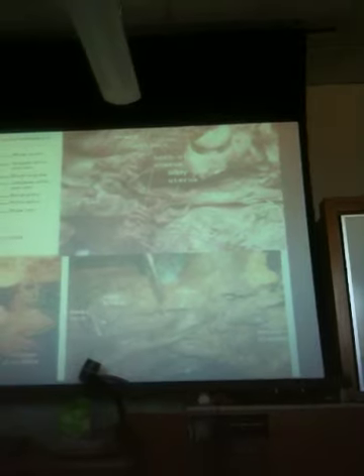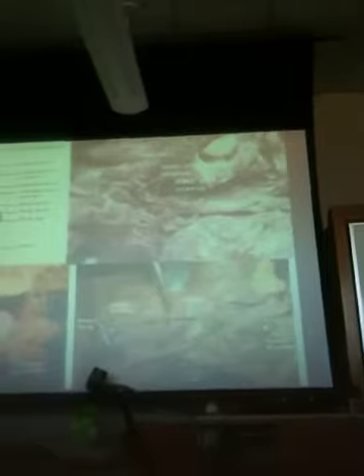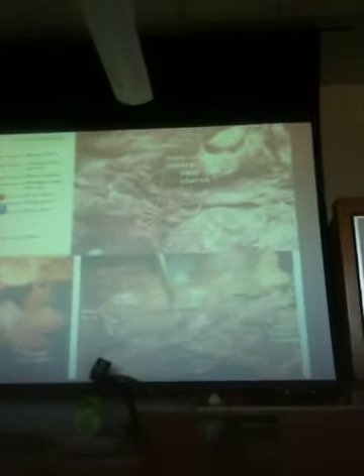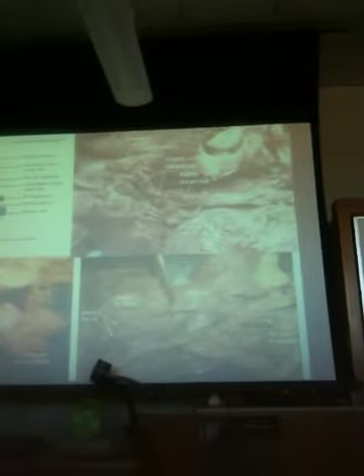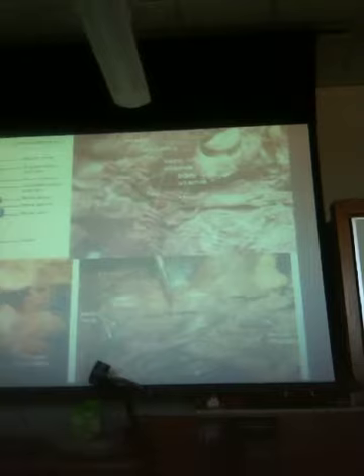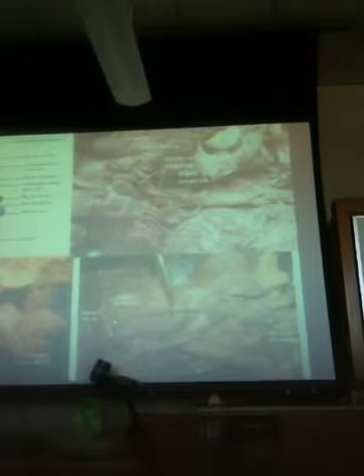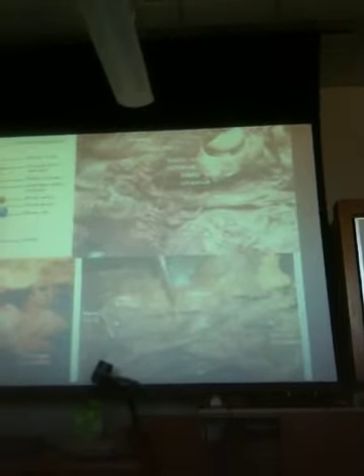Different kind of uterus. Anything that has multiple births has a different uterus than a human. Humans' uteruses, uteri, are only meant really for 1 or 2 embryos, but these guys have multiple births, like 10, 12, and so they have a Y-shaped uterus. So this whole thing is uterus. This is not fallopian tube. In a human, this would look more like a fallopian tube, but not in a mink.